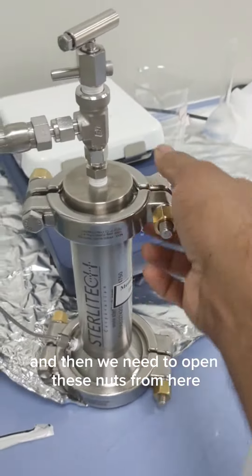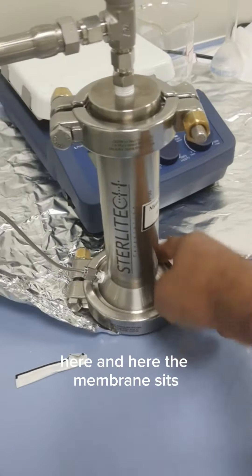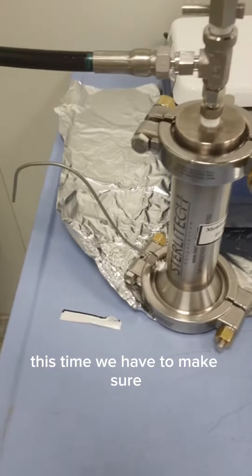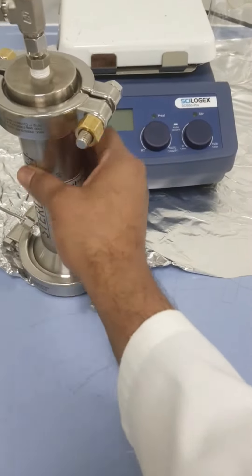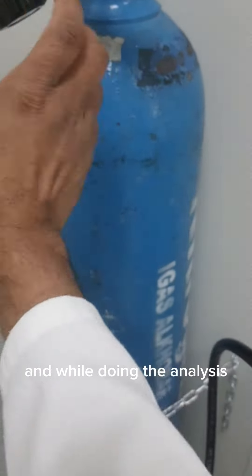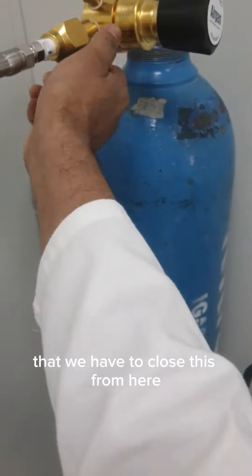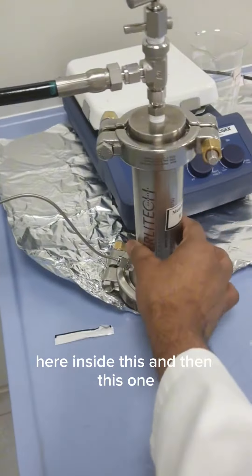Then we need to open these nuts from here, here, and here. The membrane sits inside, so first we have to make sure we release the pressure which is built up inside the vessel. For doing this, we have to open this knob. While doing the analysis, we have to close this from here, and also it should be closed because we are purging the pressure from here to here inside the vessel.